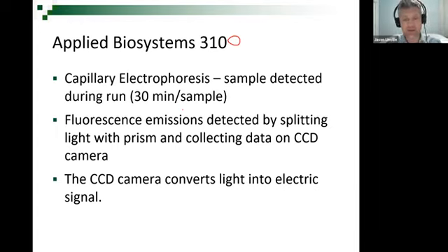Remember, this capillary is a glass tube, very thin, about the thickness of a needle, and it's covered with a special coating that allows it to be flexible and not break. So you burn off a portion of that coating. That becomes the detector window, and it's literally just a clear tube of glass where, as the DNA goes through, any fluorescence can be seen by a camera. If you want to zap it with a laser, the laser can go through the glass and hit that fluorescent dye. So with capillary electrophoresis, the fluorescence from the primers is being detected just with a normal camera.